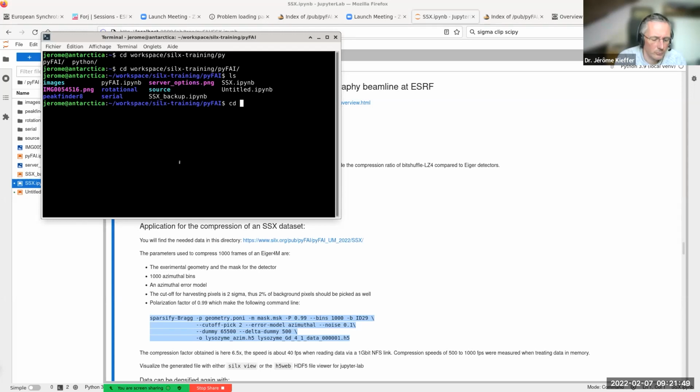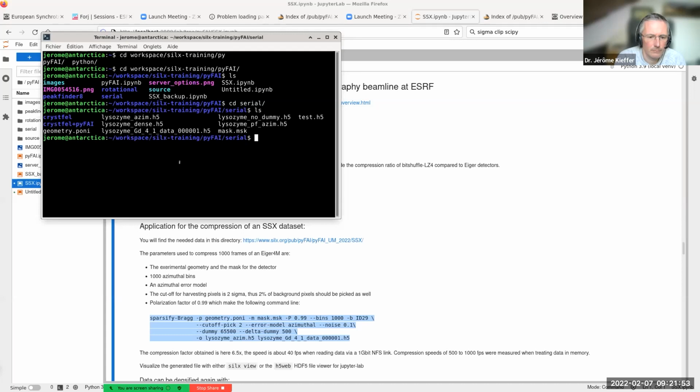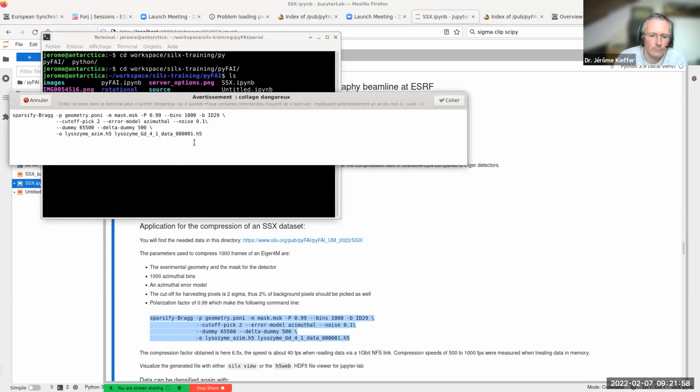So if I go to... I'll just rename the file name as live.